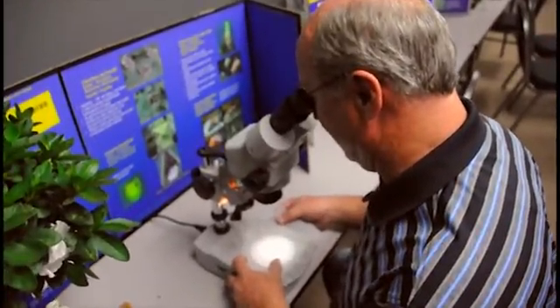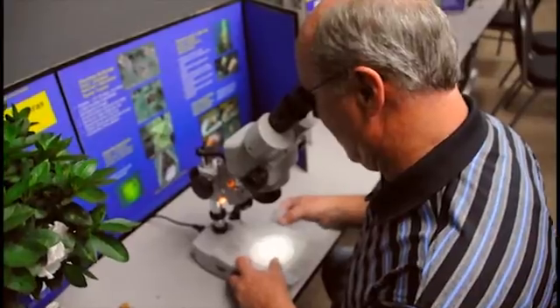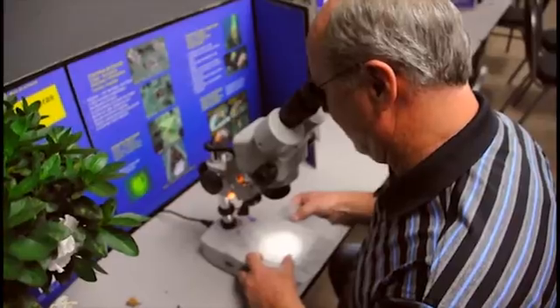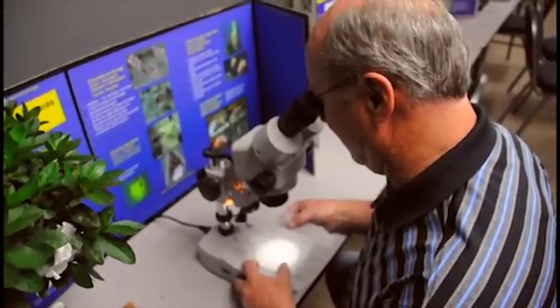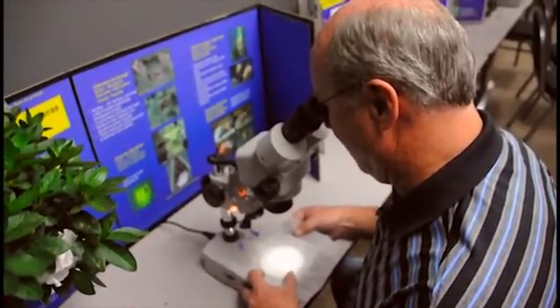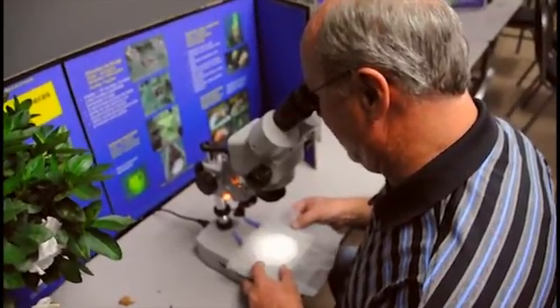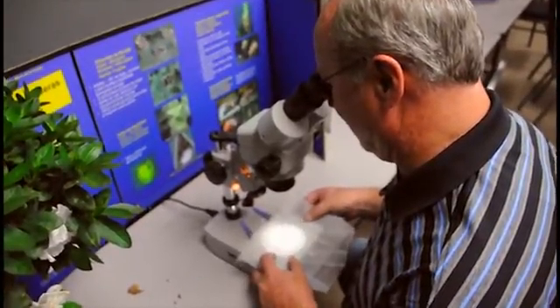And there are quite a number of aphids, some flying aphids, and lots of adult thrips. And there are some immature thrips as well. Actually, what's really interesting is there are some parasitized aphids, and I actually see a few parasites as well that have parasitized the aphids are also in this sample.